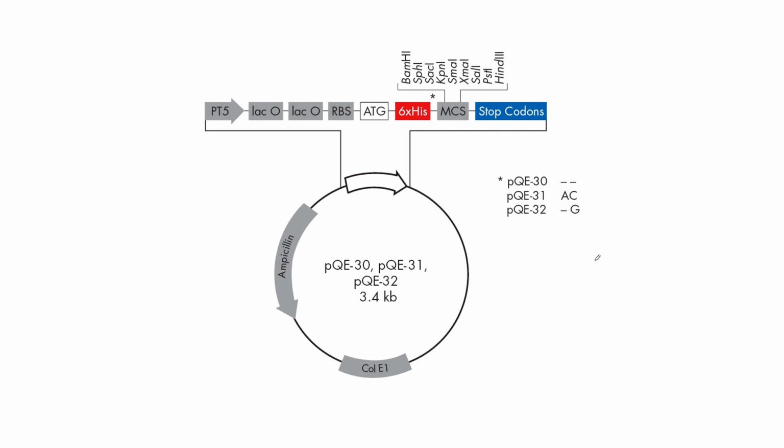In this video, I'd like to explain one of the major features of this vector that we're cloning into PQE31, and that is this thing right here. It's called a his tag, and I want to explain why that is in the vector and what we're going to use it for. Remember that the most common use for molecular cloning is in the lab.